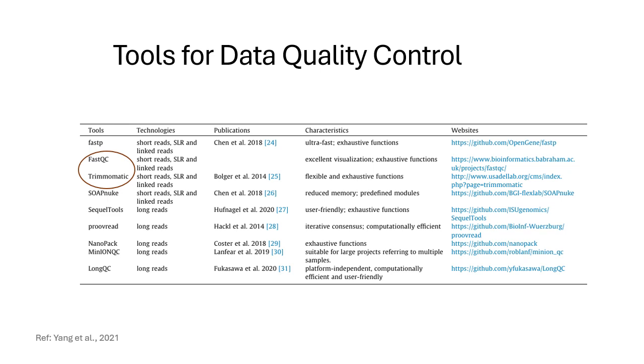And there's another tool called MultiQC, which is a powerful tool that simplifies the process of working with multiple datasets by aggregating the results from quality control tools like FastQC, Trimmomatic, and many others. So instead of manually reviewing separate reports, MultiQC combines them into a single file to navigate. And this feature is particularly useful for large projects involving multiple samples.